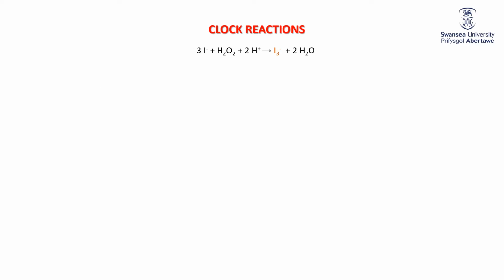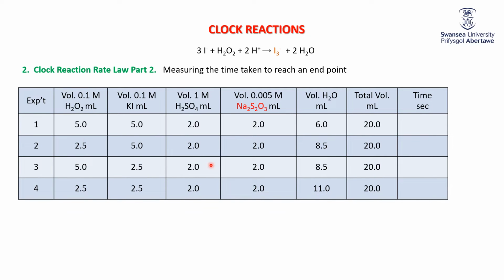So let's talk about what we actually did in the lab. Okay, so you had a series of mixings to put together. We had 4 different solutions. When you're doing this yourself, you do all 4 of these. The idea was that to save time on our A-level day, one group did the mixings for 1, one group did the mixings for 2, one did the mixings for 3, one did the mixings for 4.